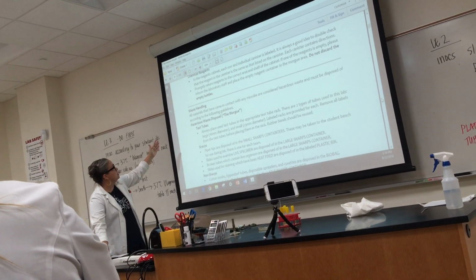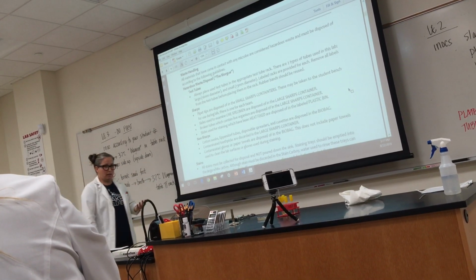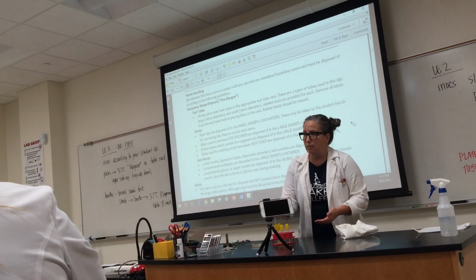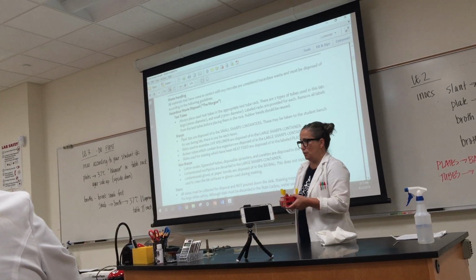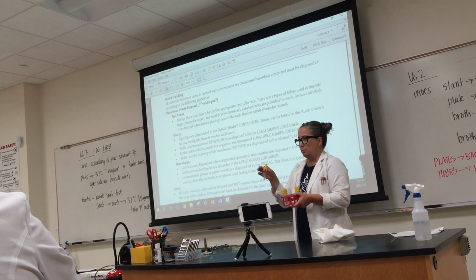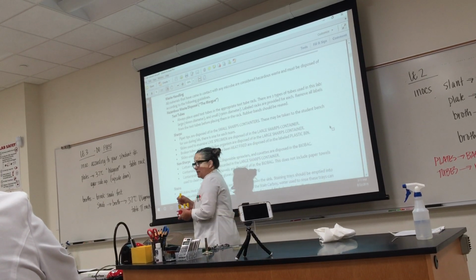We are going to talk about some waste handling because, as a practice, we're going to start using the morgue today. So when you are done, and everyone in your team is done, and you have E. coli to discard, we're not going to discard the plates, but we are going to discard the tubes. So we will remove the stickers. When something goes into the morgue, there should be no labeling on it at all. That just saves our lab tech some time. She's got 7 sections that she has to clean up after.